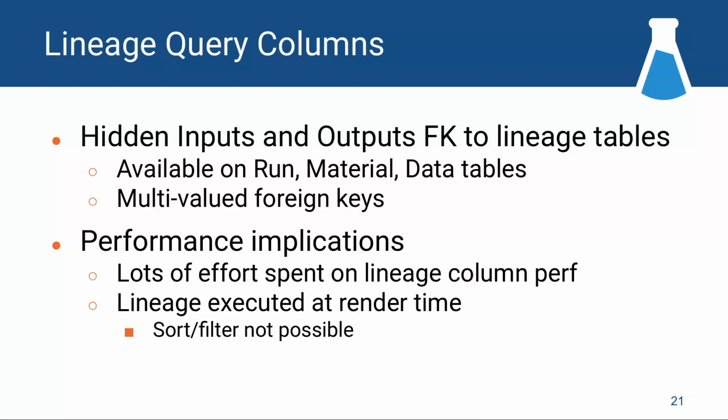That was very slow. We early on decided that we would need to shove that into the database as much as possible. So the way we do queries now for the lineage is we maintain a relationship within the database as much as possible to traverse the parent-child relationships. That works great. We spent a lot of time tuning that.